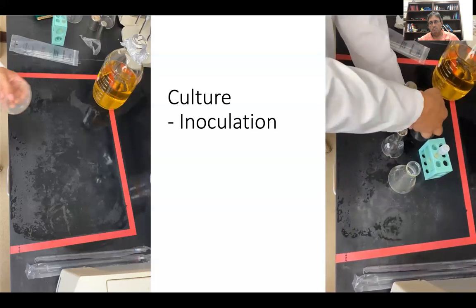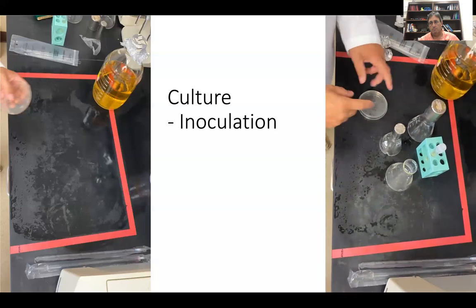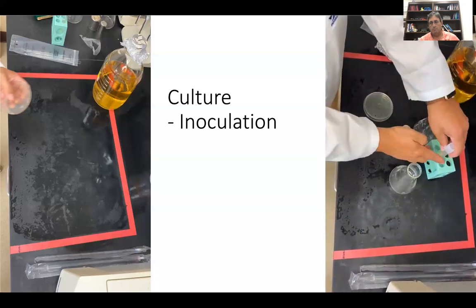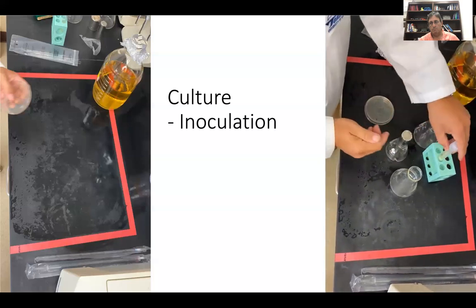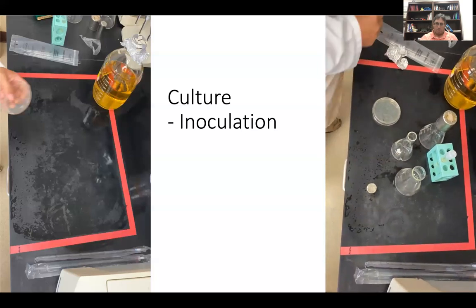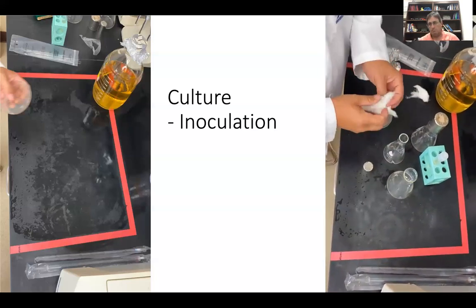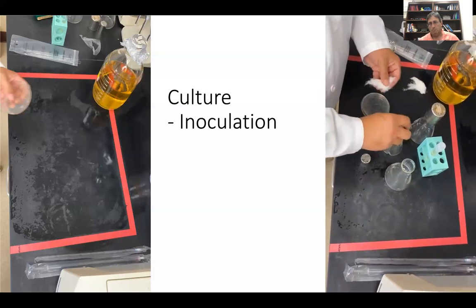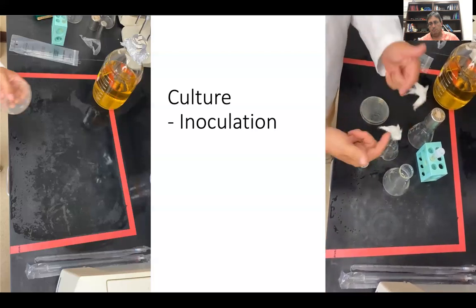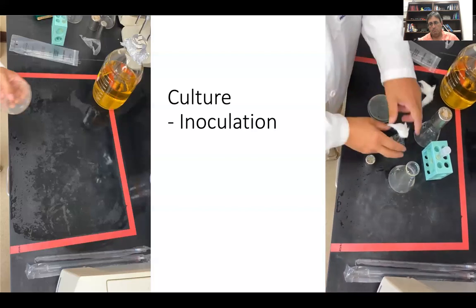Larger vessels, same kind of thing, have their own caps. You notice with all three of these caps, we have some sort of a top where we have a little bit of room for air to exchange. That's very important. If you had a vessel like this and you didn't have a cap or couldn't find a cap, cotton batting is often used to stuff in there, again, enough so it won't fall in. That allows air exchange and limits gross contaminants from getting inside your solution.